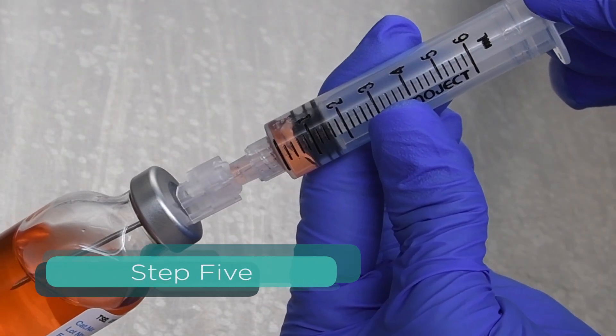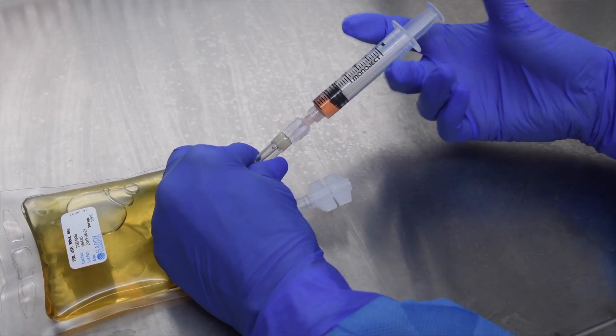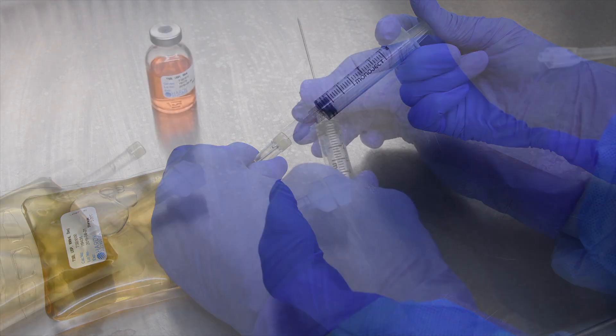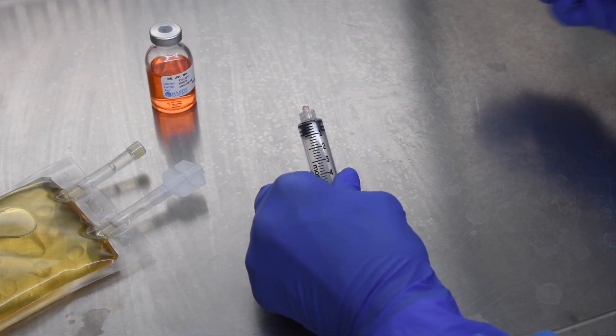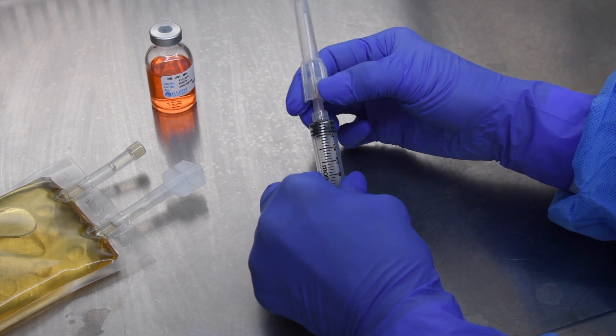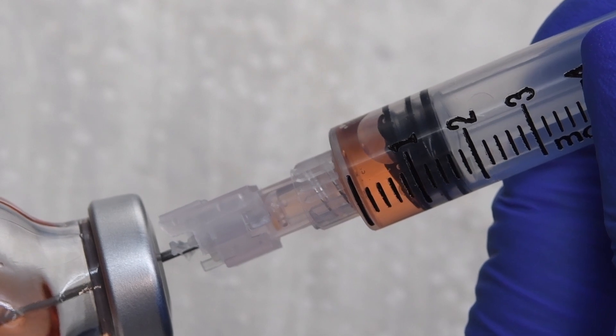Withdraw 1 ml of media from the TSB serum vial and aseptically inject into the TSB bag through the needle port. Aseptically change the needle after this exchange to increase the complexity of the manipulations using the worst case scenario approach. Use the same syringe throughout the test.